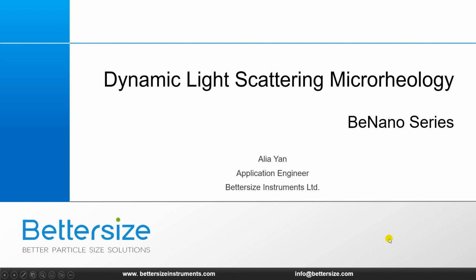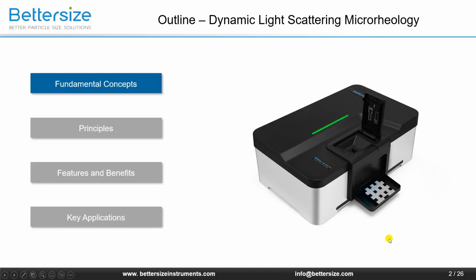This presentation is about dynamic light scattering microrheology, one of the latest updated features of the BeNano series. This presentation is divided into 4 sections: fundamental concepts, principles, features and benefits, and key applications. The first part of this presentation is fundamental concepts of rheology.